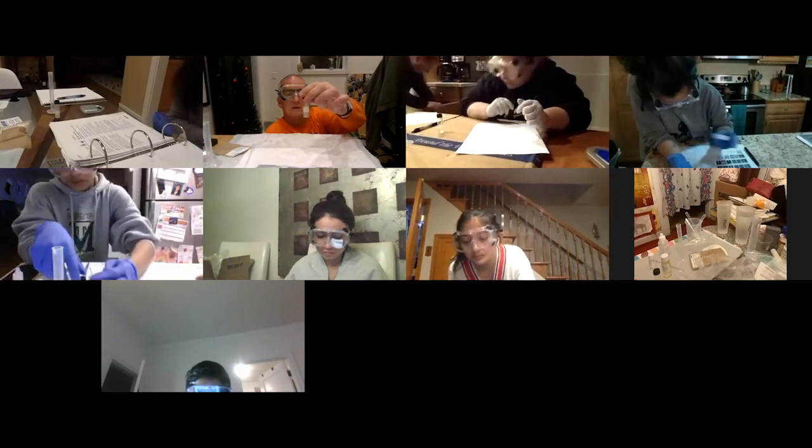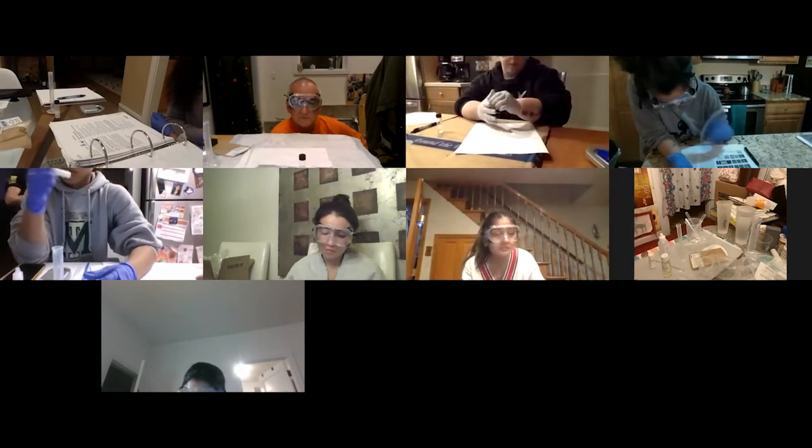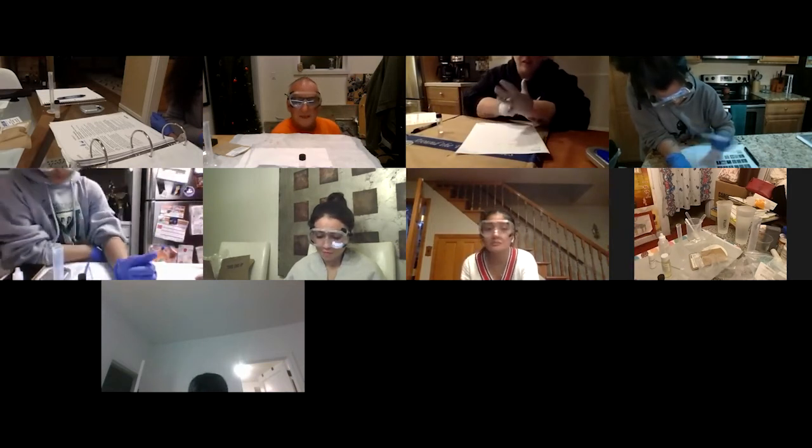Yeah, the top layer is staying cloudy. So I think that's sort of what we want. It's like the whole thing to be cloudy. Unfortunately, the lab instructions didn't come with any pictures, so I don't really know.